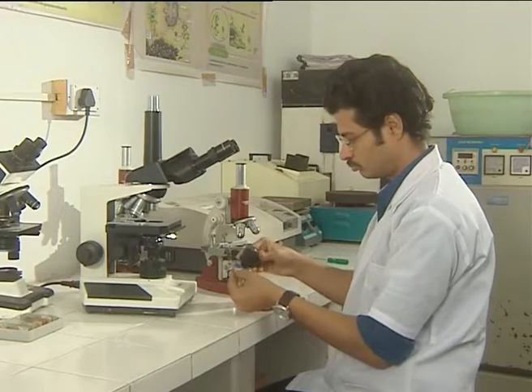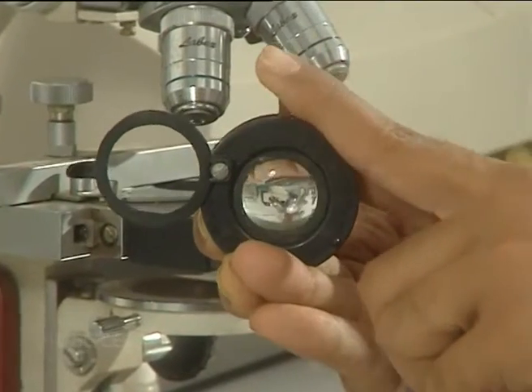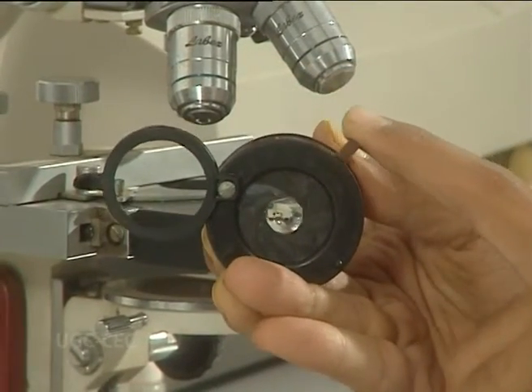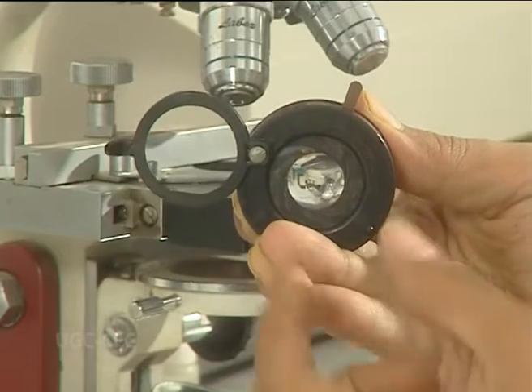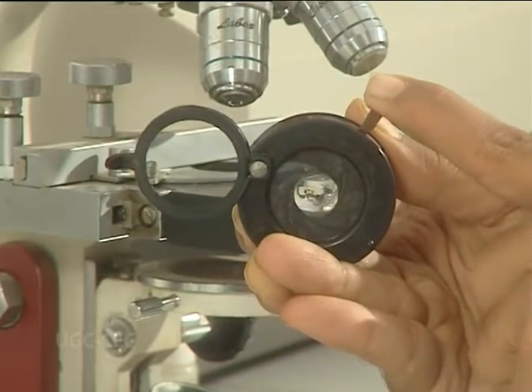Condenser. The condenser illuminates the specimen and controls the amount of light and contrast. There are 3 different types of condensers. Some condensers have a rack and pinion mechanism for up and down adjustment. The numerical aperture of a condenser should be equal to or greater than that of the objective with maximum numerical aperture. An iris diaphragm is provided below the condenser. This adjusts the numerical aperture of the condenser when using an objective having low magnifying power.